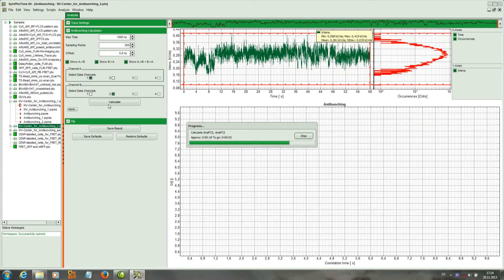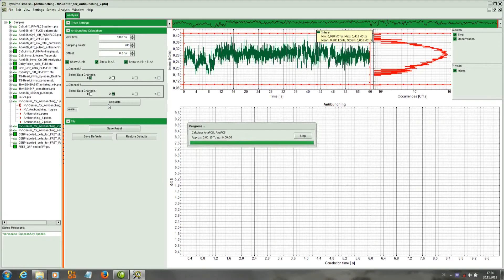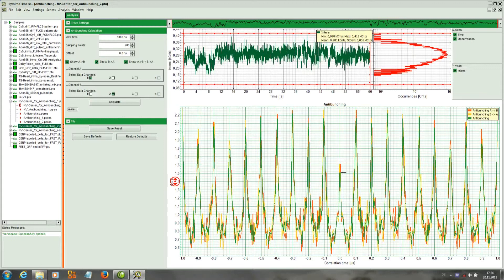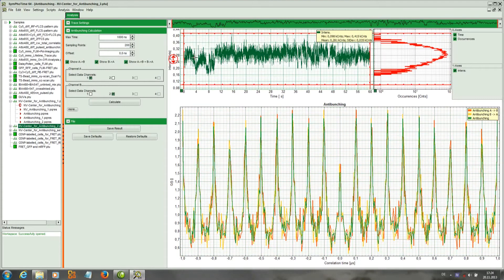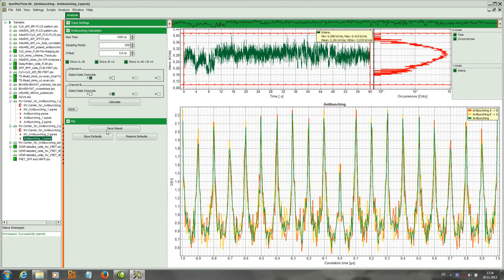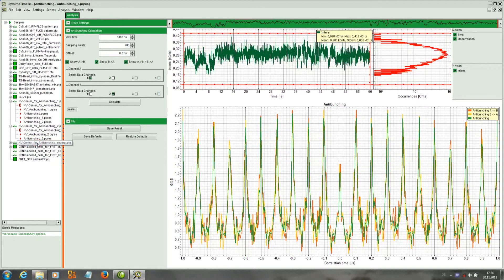And we can see once it is calculated that the middle peak here is basically only half of the height of the surrounding peaks which indicates two emitters. We save the results and go to the last file.